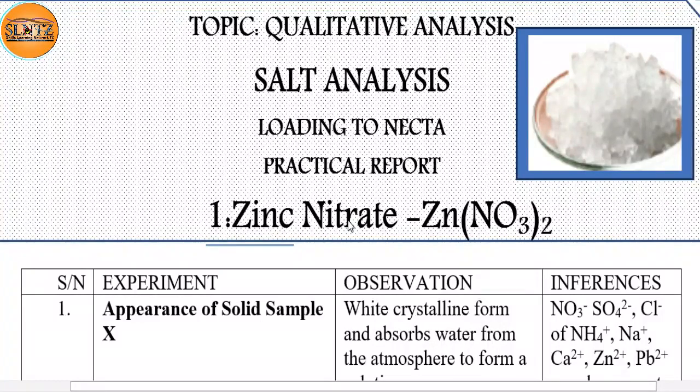This is zinc nitrate, and the appearance of zinc nitrate is white and crystalline. That is the appearance.